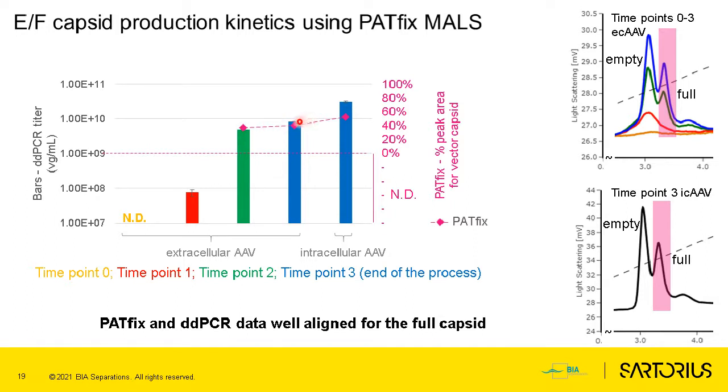But this may not be the case with the concentration of them, because if you compare everything with the PCR, we would see that in the supernatant we only see part of our product. PCR would detect everything, but the HPLC would not really give us the amount which is in the cell.